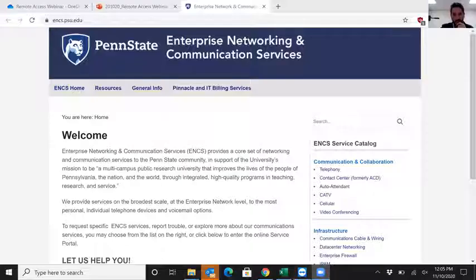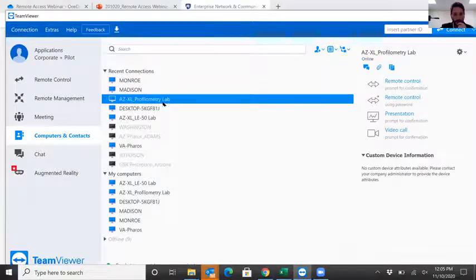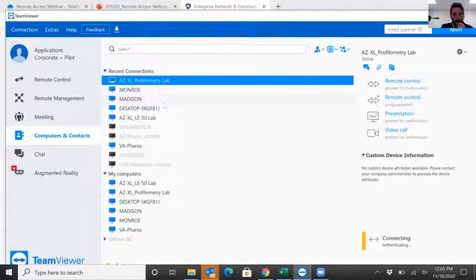And then we've seen that you were using TeamViewer. Would they also be using TeamViewer if they had an account themselves? What would you say about the remote access imaging? Yeah, TeamViewer is one option. Right now I'm using TeamViewer, but I'll show you here. We use TeamViewer here at Nanoscience, and we can TeamViewer into our customers' instruments. Here I have TeamViewer, and you can see all of the different Phenoms throughout Nanoscience. And this one here is the one that's in the lab that I'm working on right now.